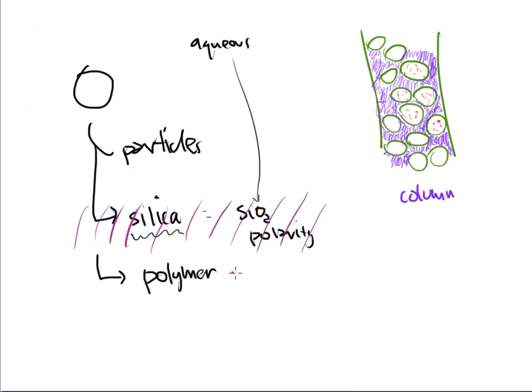The problem is that the polymer-based is typically organic, okay? Polymers are basically organic molecules, and these polymers are basically linkages of one molecule to another molecule to another one to another one. And they can become three-dimensional, meaning that maybe every other one I could see another one that's sticking up, right? And then all the way through, I can get another chain that connects it down here. I mean, these things are three-dimensional in nature, and that's something that I have to deal with.